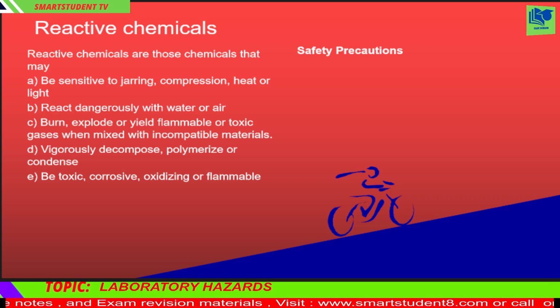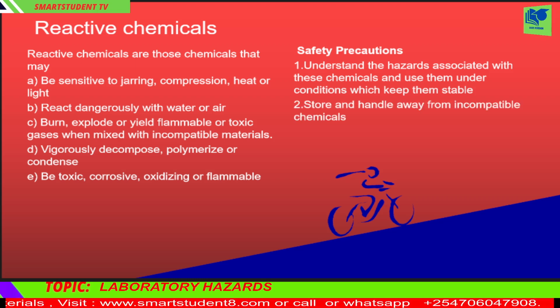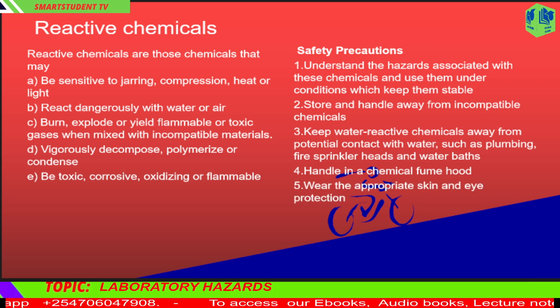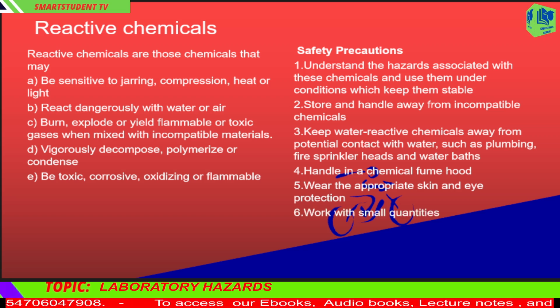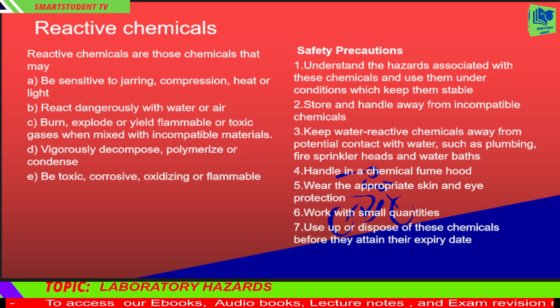When using dangerously reactive chemicals: 1. Understand the hazards associated with these chemicals and use them under conditions which keep them stable. 2. Store and handle away from incompatible chemicals. 3. Keep water-reactive chemicals away from potential contact with water. 4. Handle in a chemical fume hood. 5. Wear the appropriate skin and eye protection. 6. Work with small quantities. 7. Use up or dispose of these chemicals before they attain their expiry date.